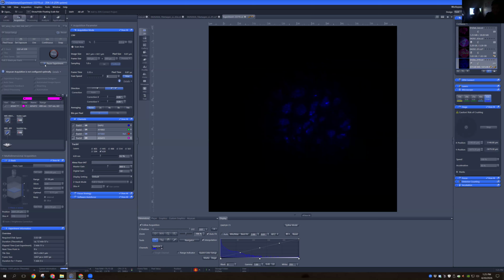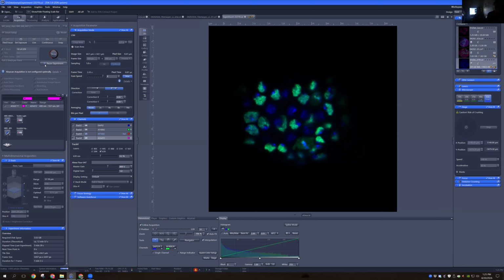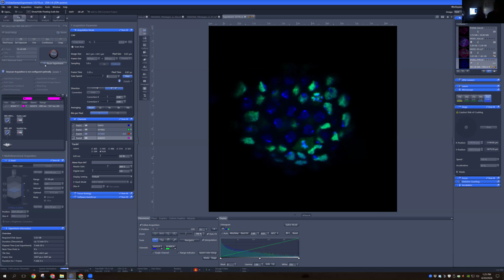And so I did about 6 hours of training with the machine. And at that point, I was considered fully trained and able to use it myself. But I still ask lots of questions when things are a little bit weird with the microscope, from some of the more senior people in the lab.